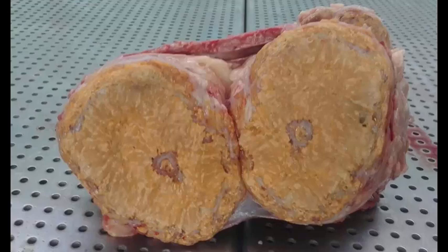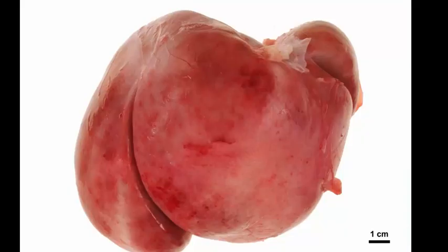Okay, hope you're enjoying this as much as I am, but probably not, because I have all the answers in front of me. Question number 5. Oh, a wonderful picture. This is from a rhesus macaque. The question is, this condition has been associated with which of the following? A, advancing age. B, multiple myeloma. C, generalized inflammation. Or D, all of the above.